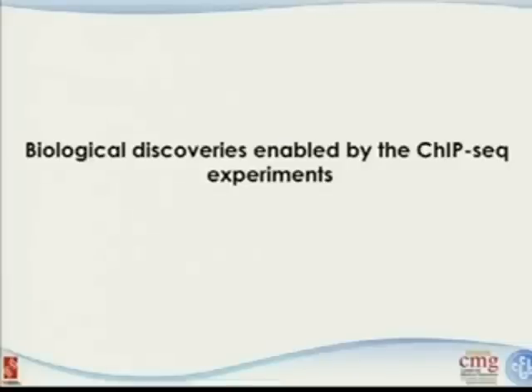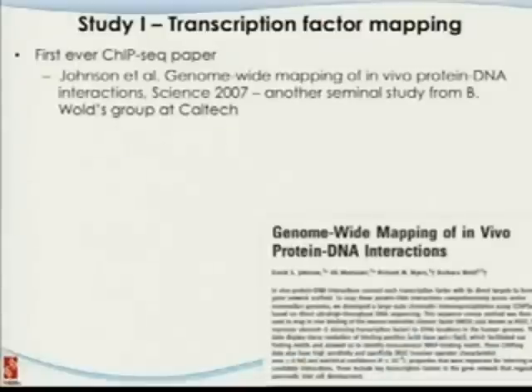So basically, let me reiterate the approach. The methodology itself is kind of straightforward, right? You do the cross-linking of the DNA, so the protein is bound here. You shear the DNA into smaller pieces, you use an antibody to target that protein, and then you sequence it. That's it, right? In the earlier stage, a ChIP assay could do the same job, and now ChIPseq is doing much better. So that's a brief summary.